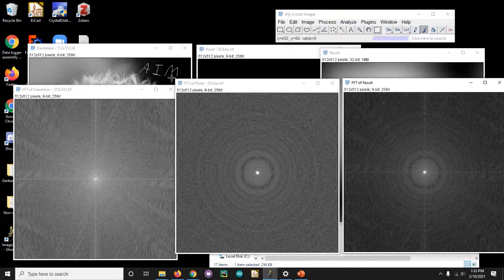Now it should be really apparent: what's a deconvolution? It's subtraction in log space or division in the original space. We should be able to get back to this image by doing this Fourier transform minus that Fourier transform. So we can close this, and close this, and oh no, we just lost it. This is what I call the CSI deconvolution, because there's no signal there. There's nothing left. You'd expect this deconvolution might return something, but it shouldn't return the full image. But you can try and see what we get back.